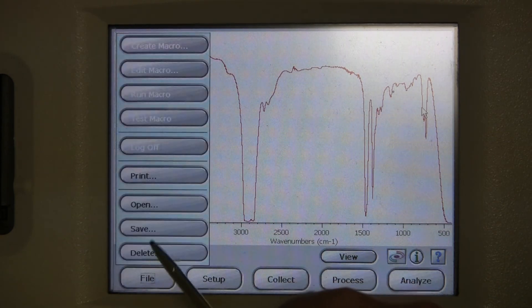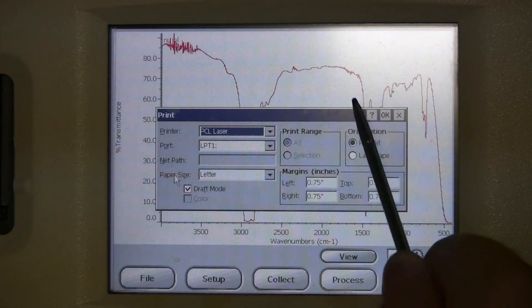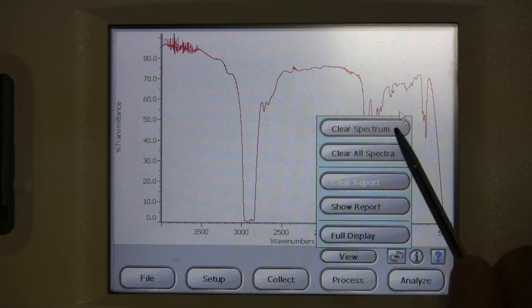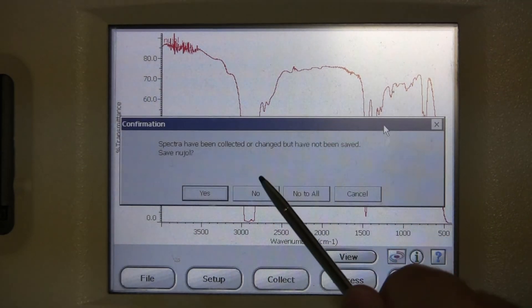Go to File, Print, change it to landscape, and then hit OK. Go to Process, Clear Spectrum, and then click No to clear the screen.